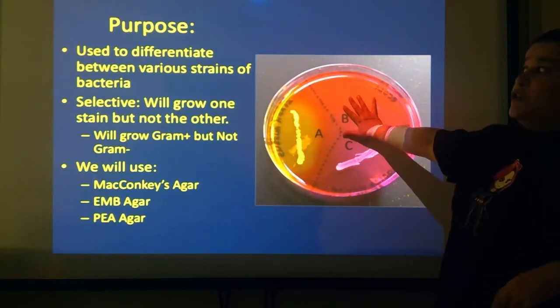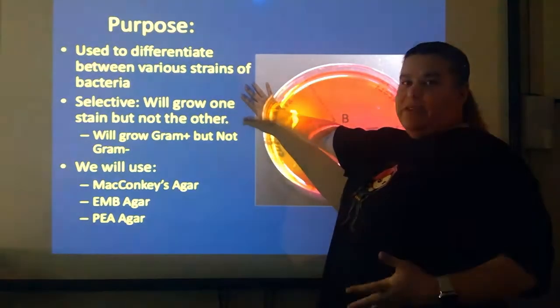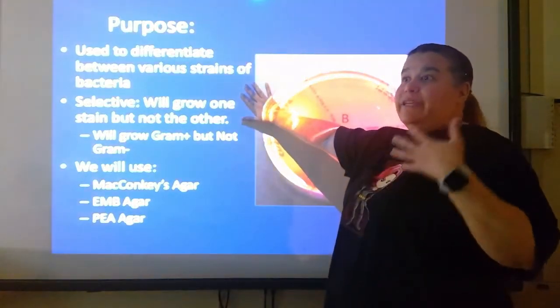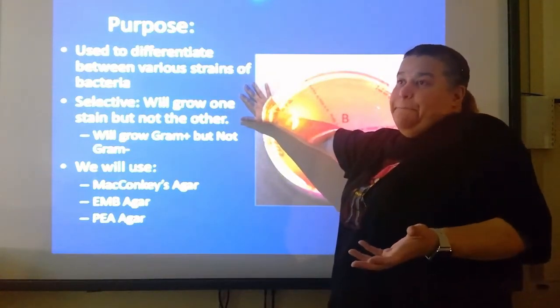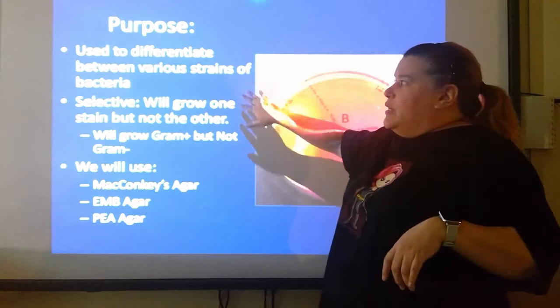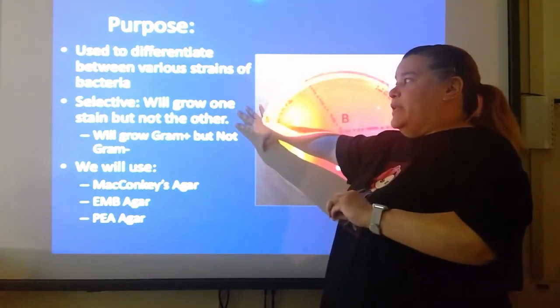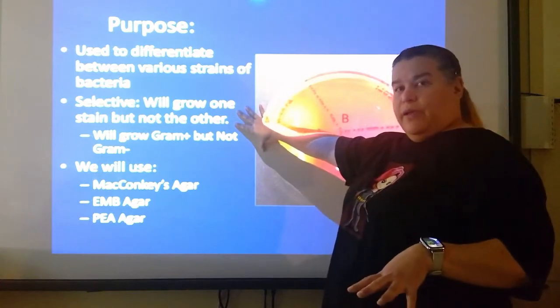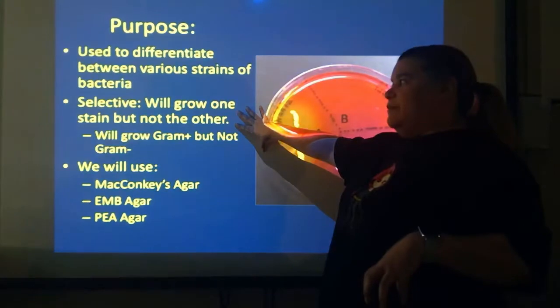Again, what's the purpose? It's used to differentiate between various strains of bacteria. Every bacteria will not react the same way, based on years of research. Selective means that it will grow one strain but not the other. It'll grow, again, gram-positive but not gram-negative.